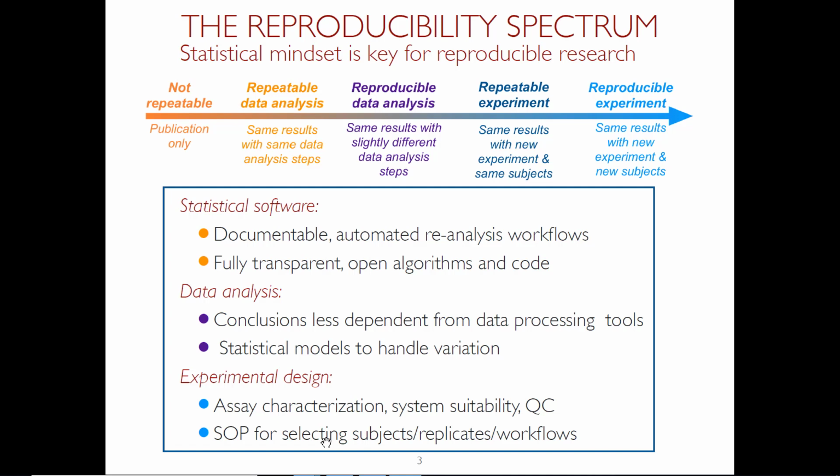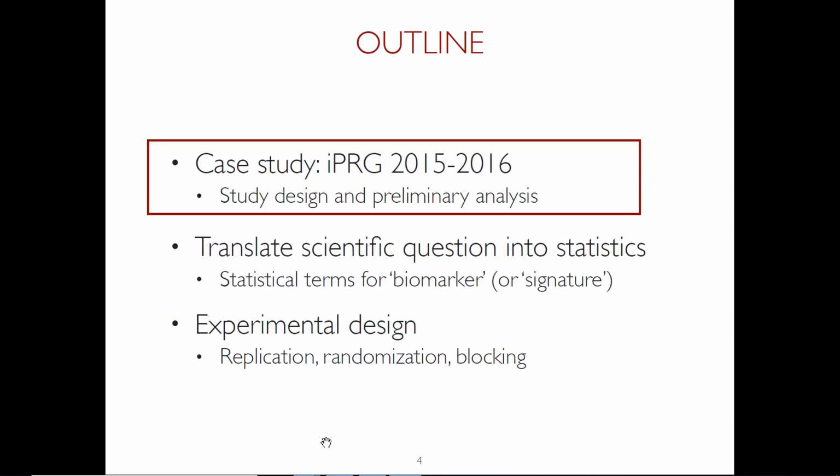So then let me move on to what I actually would like to do in this next hour and a half. There are 3 topics I would really like to address. The first of them is the motivation of why we feel that we need to talk about statistics and data processing and reproducible research, specifically for mass spectrometry and proteomics.